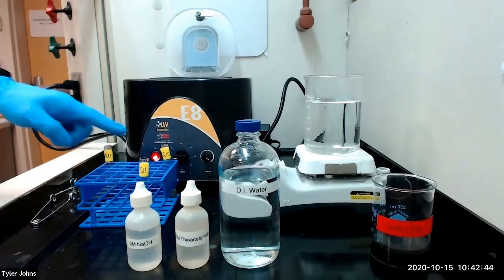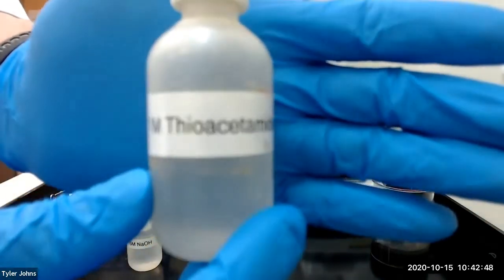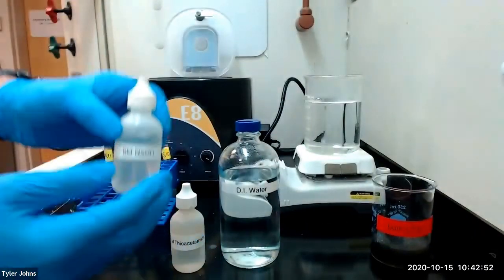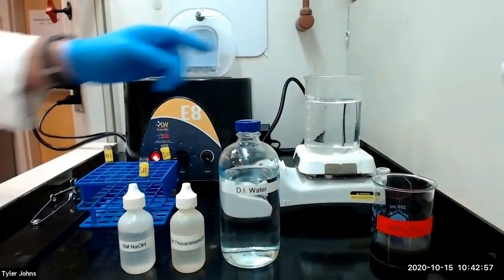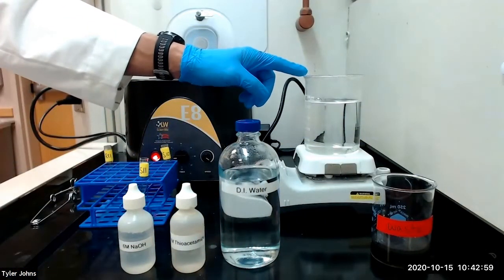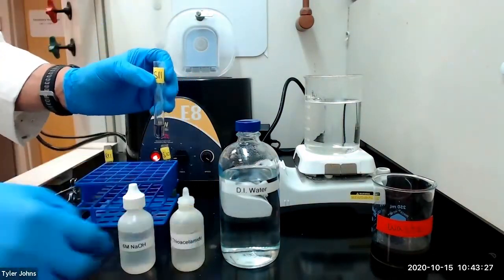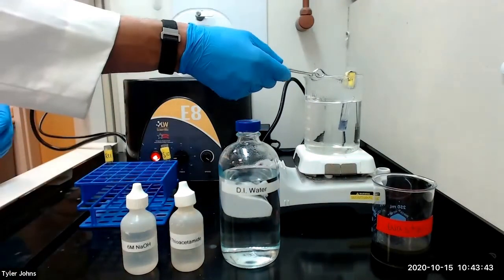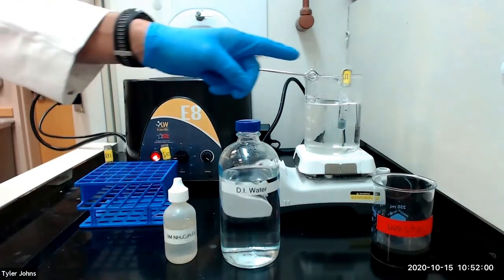To solution S11, we will add 1 drop of 1 molar thioacetamide and 1 drop of 6 molar sodium hydroxide. We will then place in a hot water bath and heat for 5 minutes. This produces sodium hydrosulfide, which ensures sufficient sulfide ion.